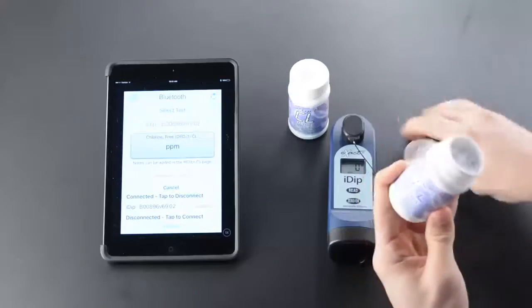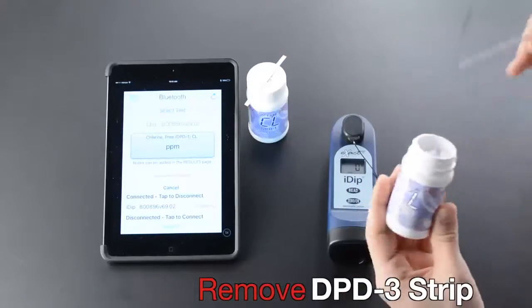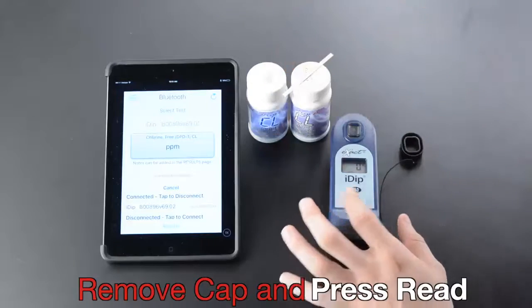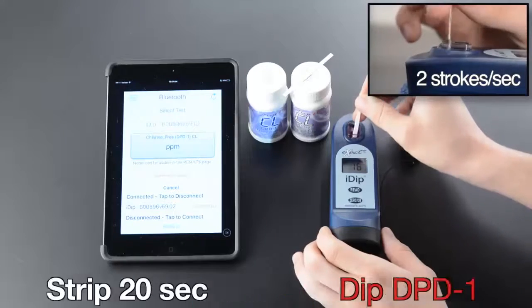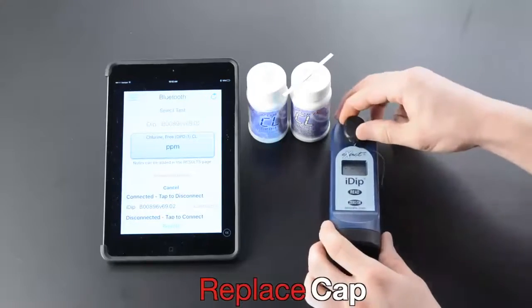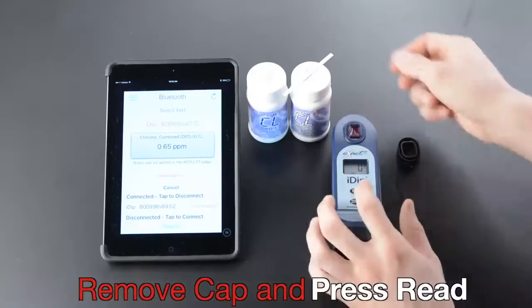Remove strip and replace lid on bottle. Remove cap and press Read, then dip strip for 20 seconds at two strokes per second. Remove strip at one second, replace cap, and zero eXact IDIP.